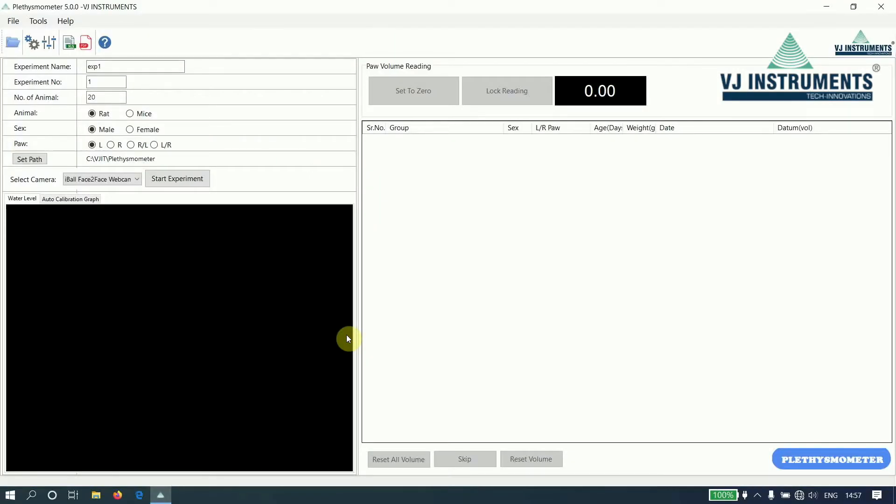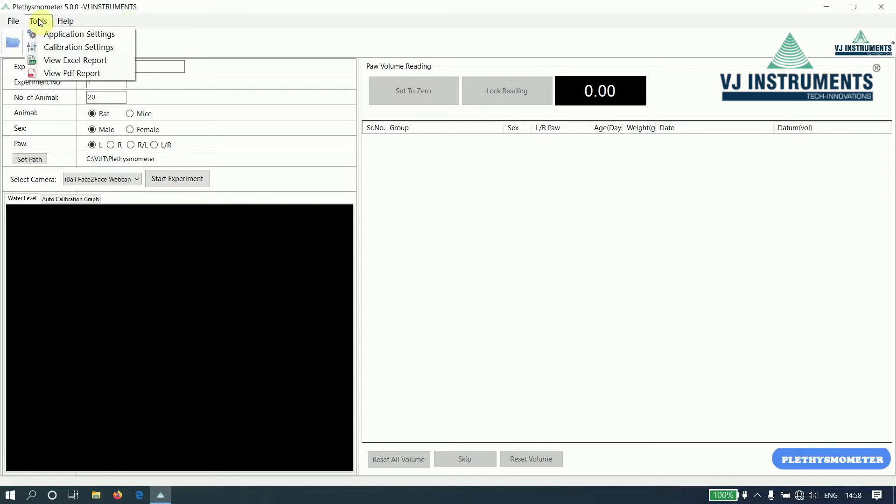This is the main window of the application. It has a menu bar and toolbar. In the menu bar, we have options like application settings, calibration settings, and options to view the reports.